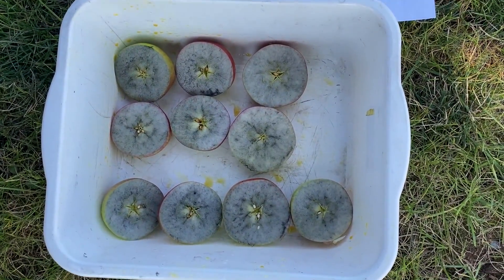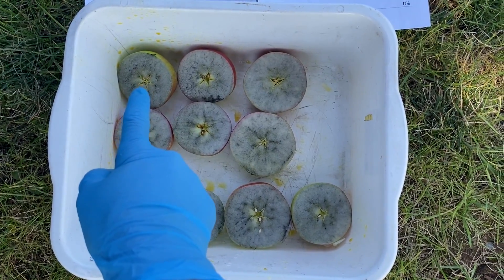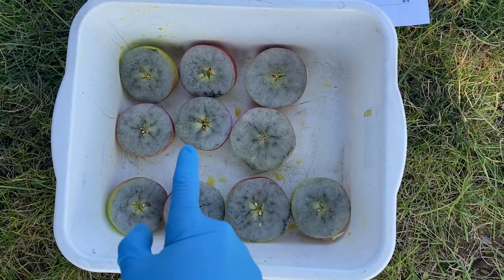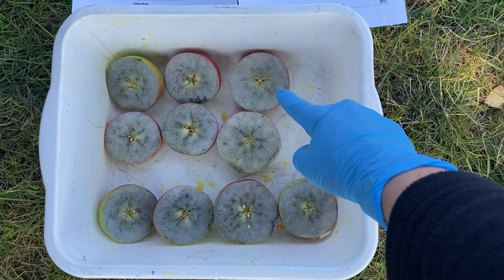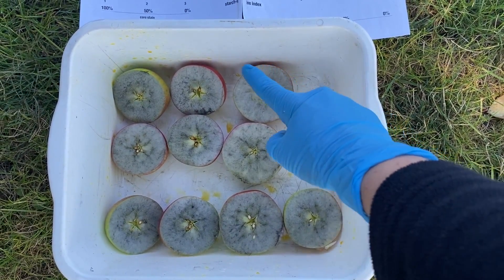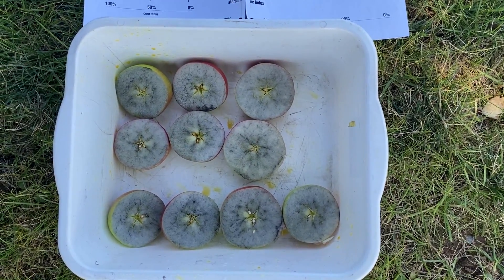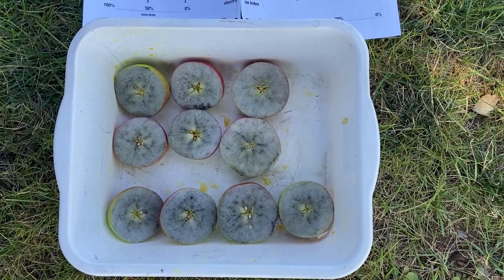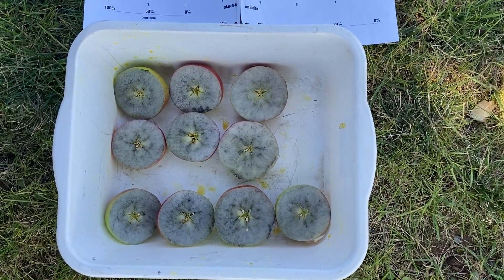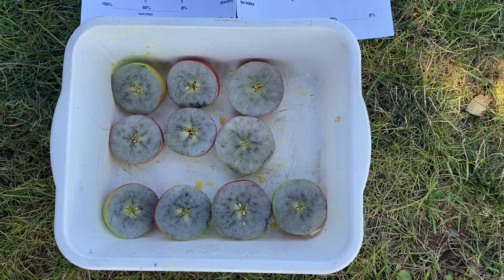Looking at the apple samples here, we can see that we're starting to get a little bit of starch movement to sugars in the core of some of these fruit, but there are also fruit where it's still completely filled with starch. You would go through and rate each one, then average the 10 ratings, and that would represent the starch index for your block.